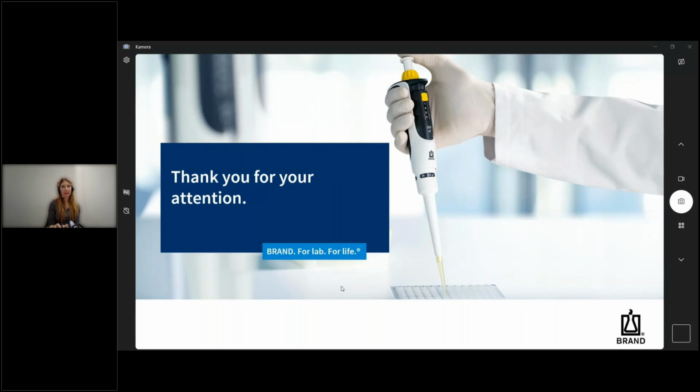Yes, we have some questions. One question is about the Z factor. You mentioned the Z factor in your presentation. What is this factor?